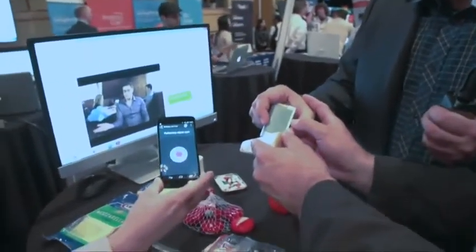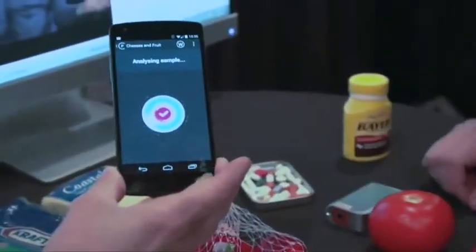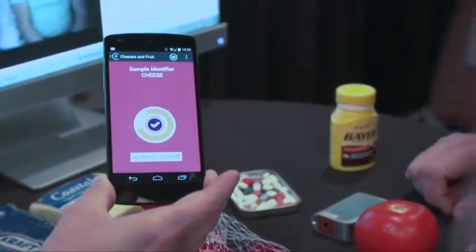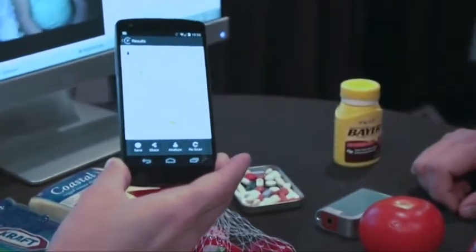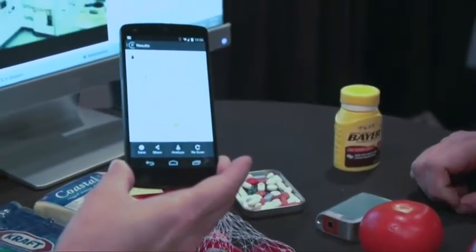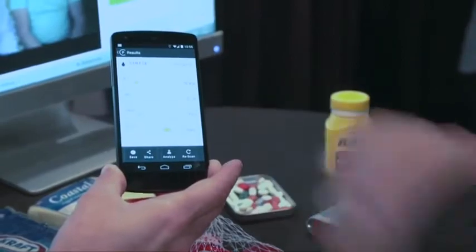So this is Parmesan cheese, and you're just going to measure it like this. So you got the Parmesan cheese going up to the cloud, back for analysis — about 28% fat, like Parmesan cheese, and about 360 calories per 100 grams.